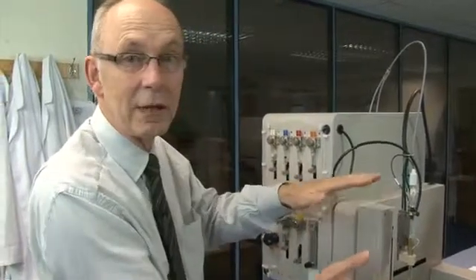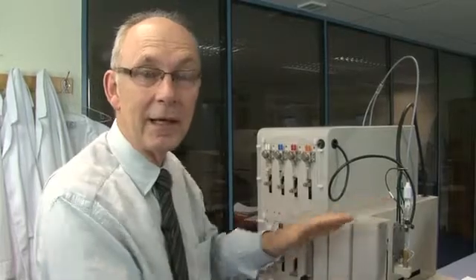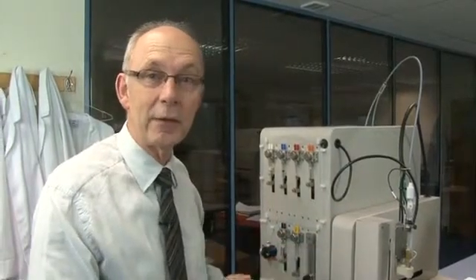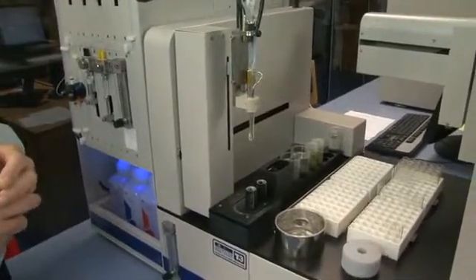All of these components, plus a couple more, are required during the measurements we make, but these work very well and they are now to be found in laboratories all over the world who are using this technology for drug PhysChem property measurement.